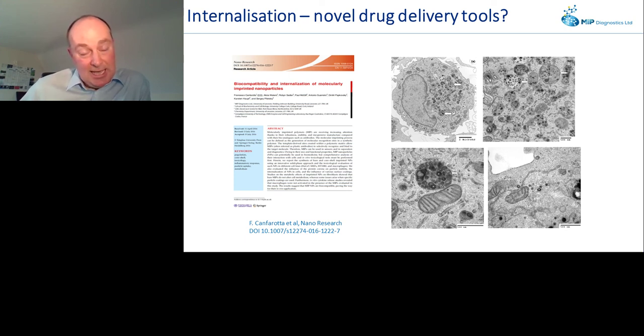Interestingly, in this particular case, the NanoMIPs themselves, being non-biodegradable, find their way to the lysosome, and therefore it's possible to determine the dose delivered to a cell on a cell-by-cell basis, simply by counting up the spots, the punctate marks highlighted with the small arrows here, within the lysosome of a cell. And comparing the phenotype to the number of spots gives a dose-response correlation.